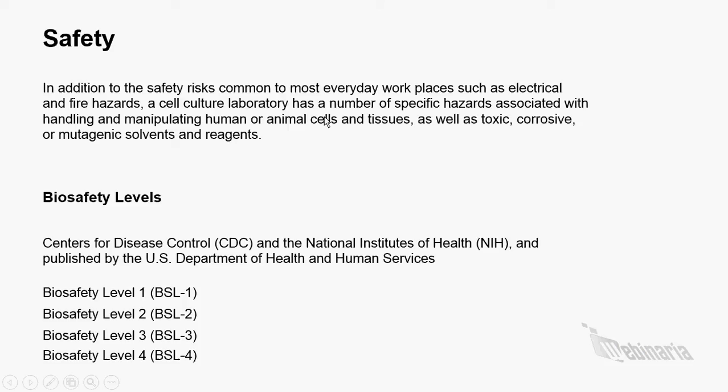There are certain safety measures, because safety is a high concern when you are working in an animal cell culture laboratory. In addition to safety risks common to most everyday workplaces, such as electrical and fire hazards, a cell culture laboratory has a number of specific hazards associated with handling and manipulating human or animal cells and tissues, as well as toxic, corrosive, and mutagenic solvents and reagents. The most common of these hazards are accidental punctures with syringe needles or other contaminated sharps, spills and splashes onto skin and mucous membranes, ingestion through mouth pipetting, or inhalation exposure to infectious aerosols.